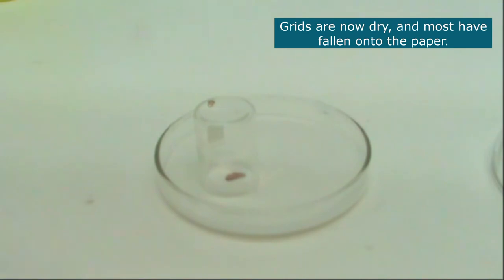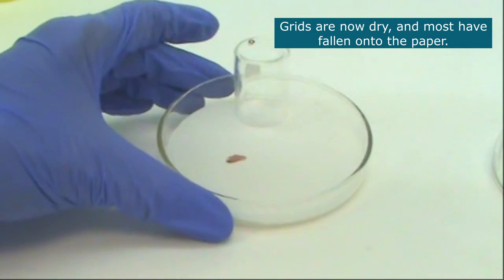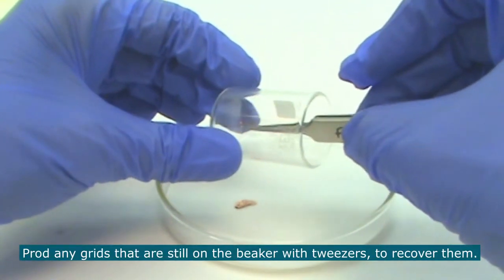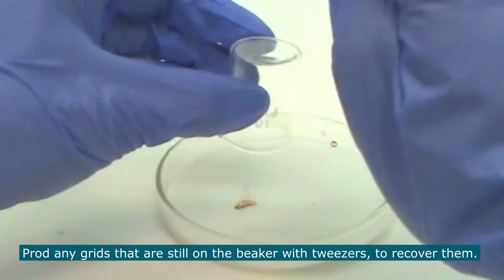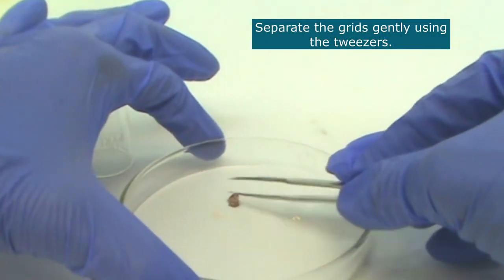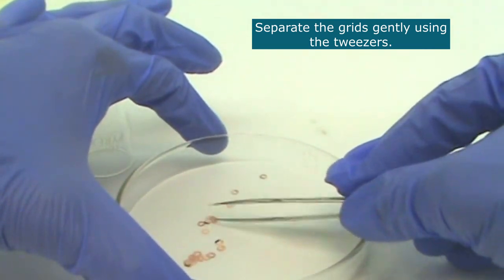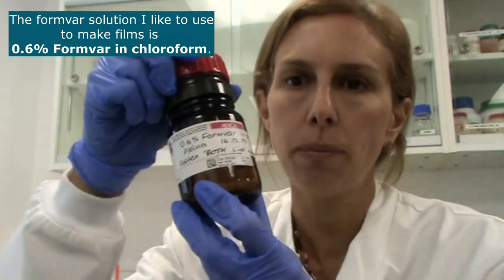Now the grids are all dry, and all but a couple have fallen down to the bottom. Now we need to make some formvar films. The formvar I like to use to make films is this one here. It's 0.6% formvar in chloroform.